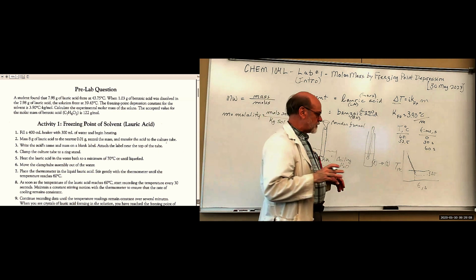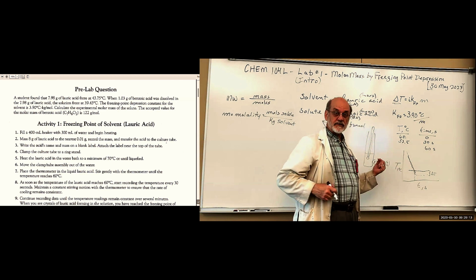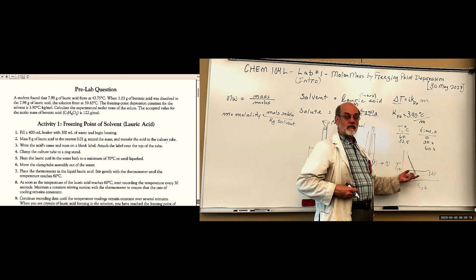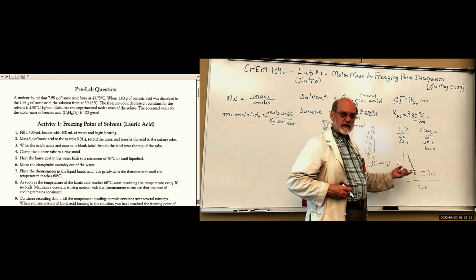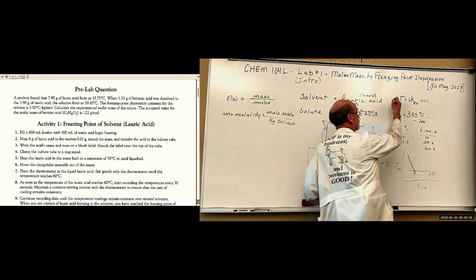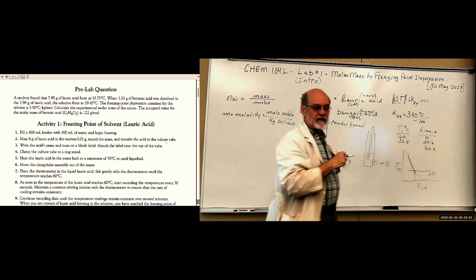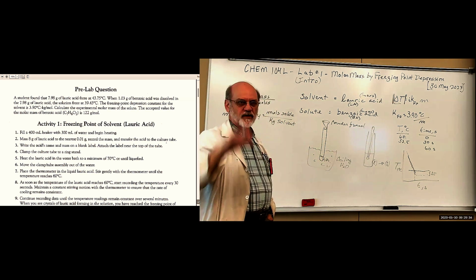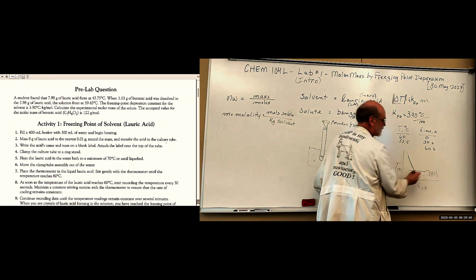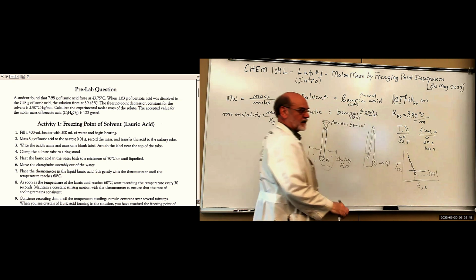That difference in temperature. And it's an absolute. Right? It doesn't matter if you subtract final temperature minus initial temperature. In this case, it'll work because no, it won't. Final temperature would be lower than initial, so you get a negative number, but we don't want negatives, right? So what we actually want is the absolute value, just the temperature change, right? If you got a negative sign, throw it out. We only want the difference in temperature here, absolute difference.